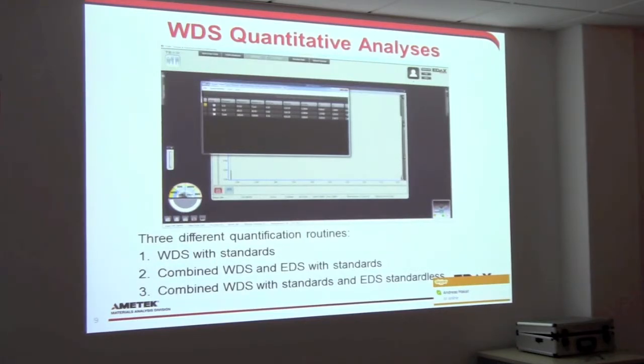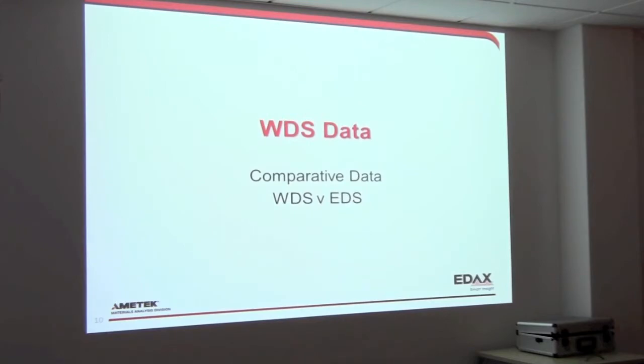Quantitative analysis, once again, set it up. Here you just get the elements, you have to collect standards, either elemental or mineral standards, as we had seen earlier today. It needs peaks and backgrounds because you always want to deal with net counts. So the background positions. What background positions? They're factory standard background positions. You should qualify them and evaluate those background positions. Most times they're very, very good, but with certain alloys there are complications. All of those parameters are built into the system. So that's where it's very nice that the system has all of this built in so that you don't have to think about it. So we will look through some data.